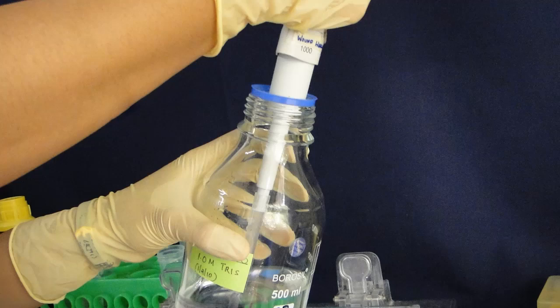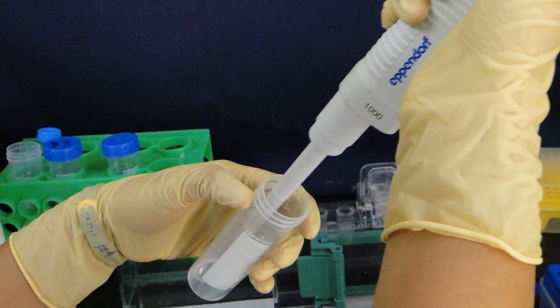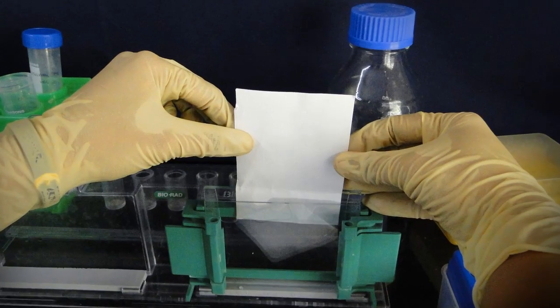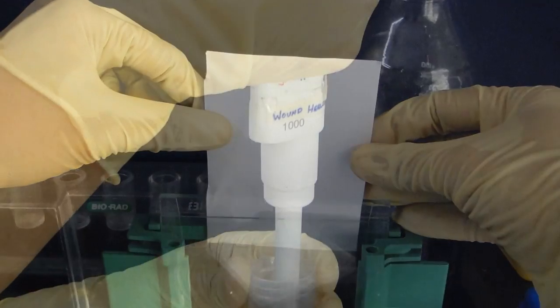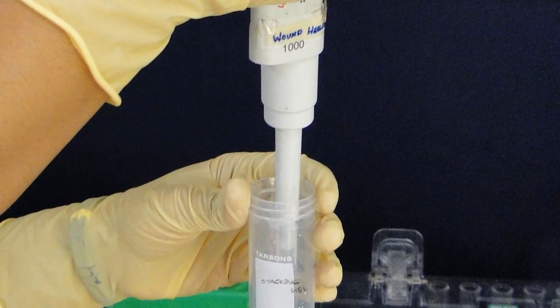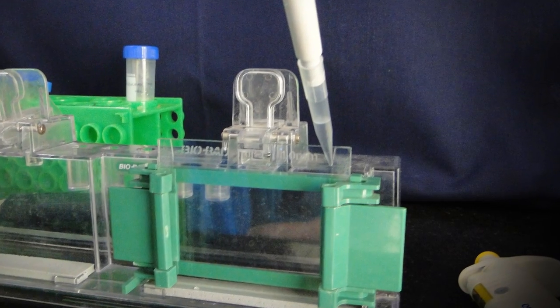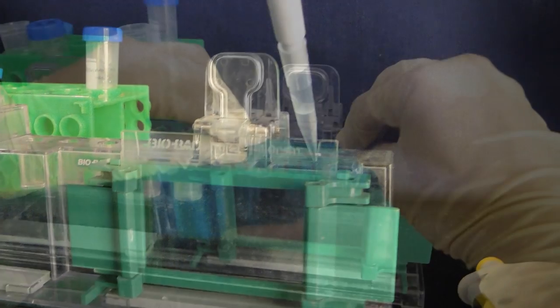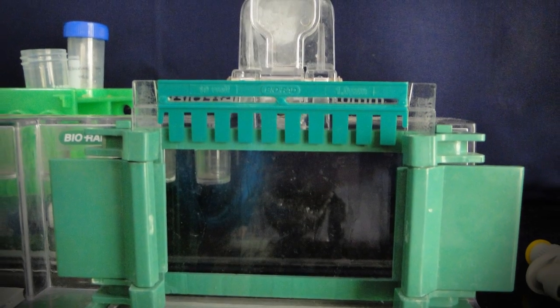Now prepare the stacking gel monomer solution by combining all the reagents except APS and TEMED. Drain the isopropanol with strips of filter paper or blotting paper. Add APS and TEMED to the monomer solution just before pouring it in between the slides and mix well by swirling gently. Place a comb in the stacking gel sandwich and allow it to polymerize for 10 minutes.